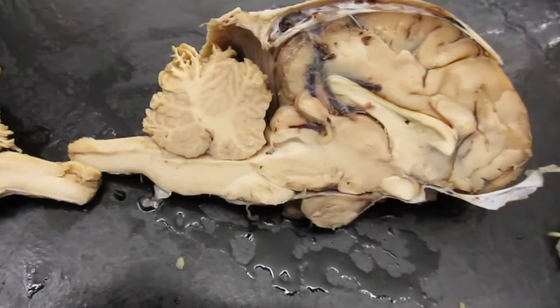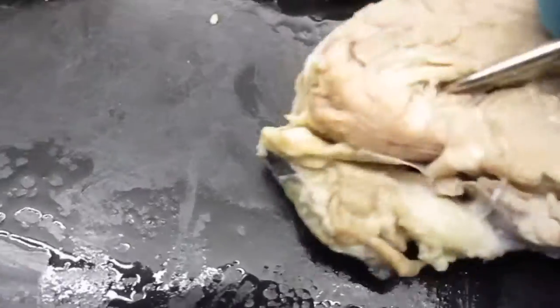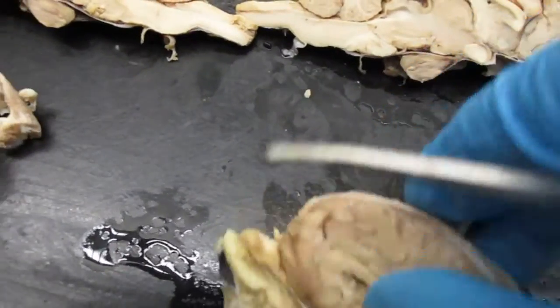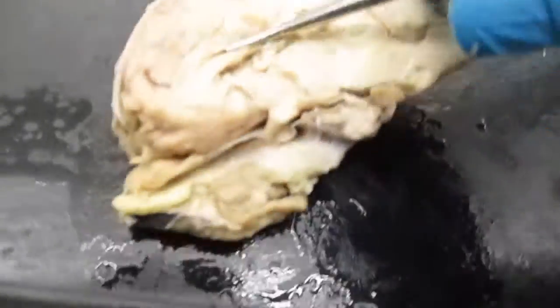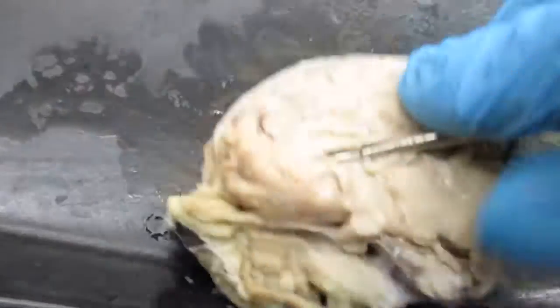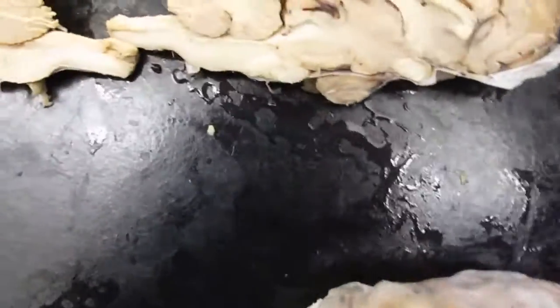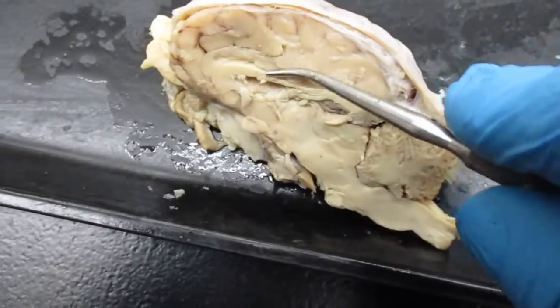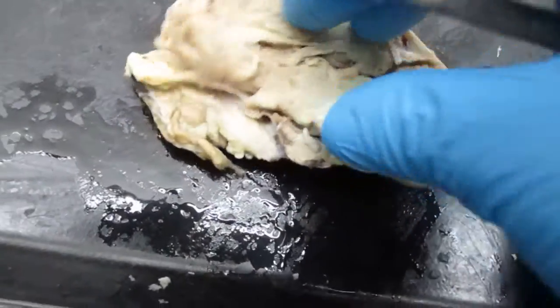And let me show you this used sheep brain here. This one might be the right one to use. If you look at the probe here, you can see this used sheep brain that's been here for a semester or so. We can see if it will hold up right. Or maybe I'll use this one. Okay, it's this one. If I can pry it open here.